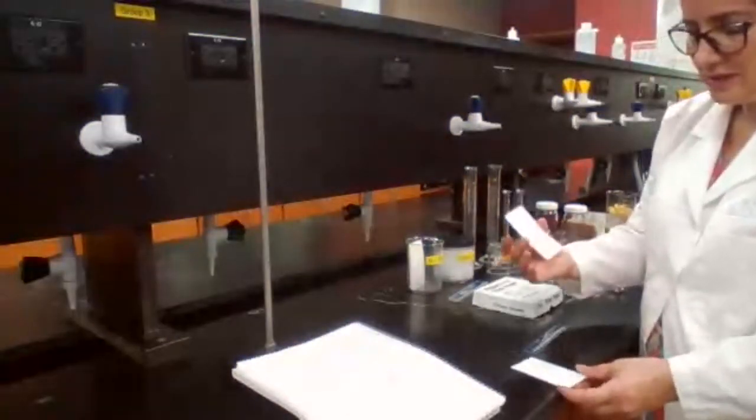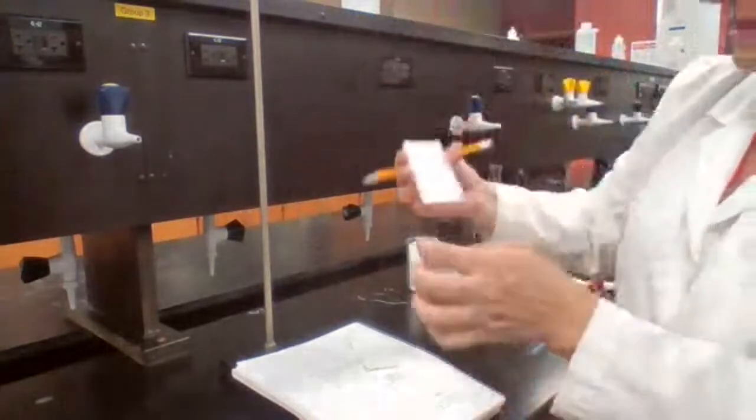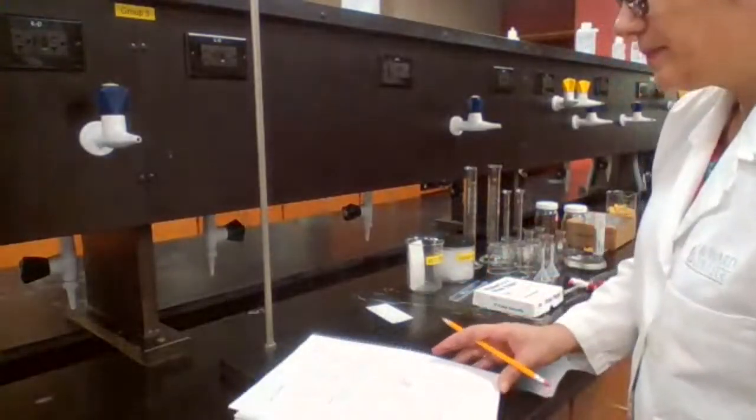Right. Question, why did I change it? I have to show you here. This corner was chipped off, and because it was chipped off, I'm not using this, and I made a new plate for that one. Okay.